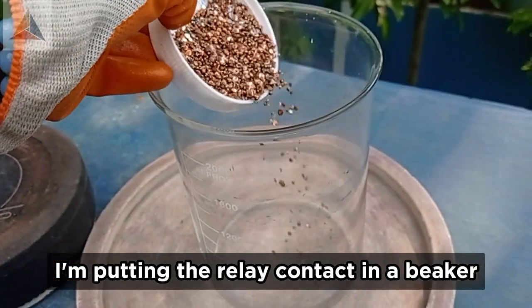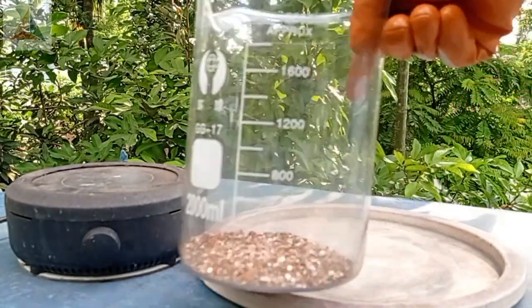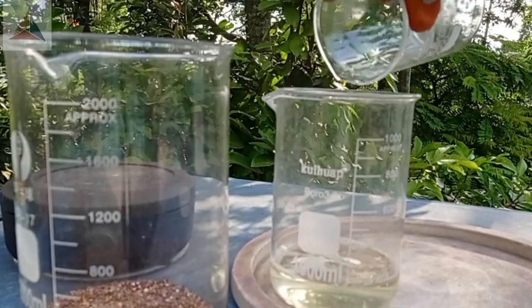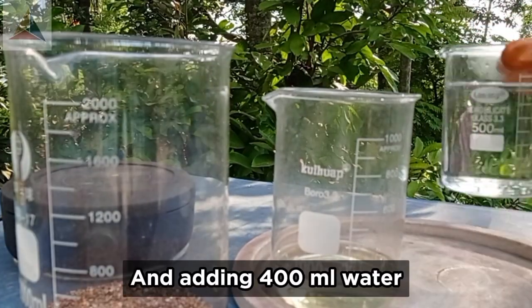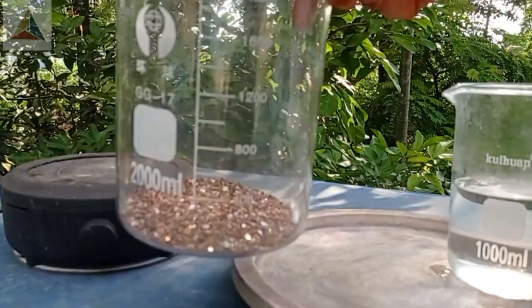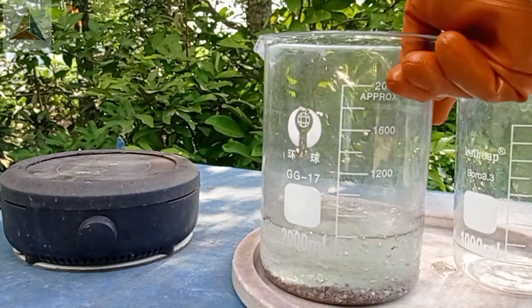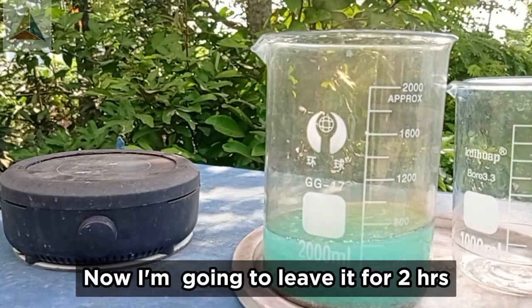I'm putting the relay contact in a beaker. Taking 200 ml HNO3 and adding 400 ml water. Adding it into the beaker of relay contact. Now I'm going to leave it for 2 hours.